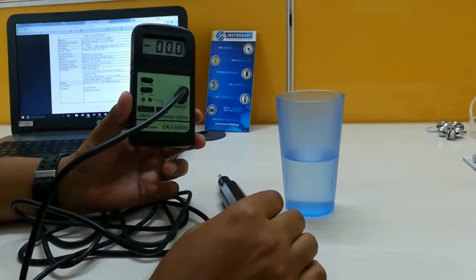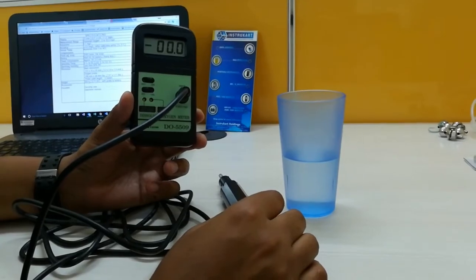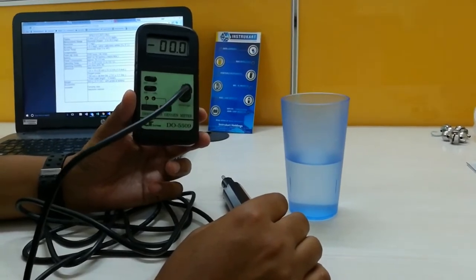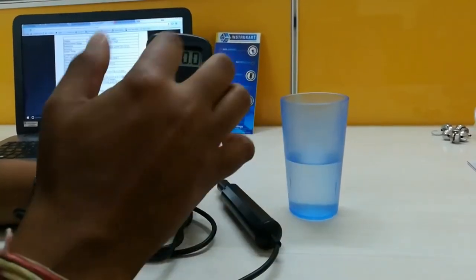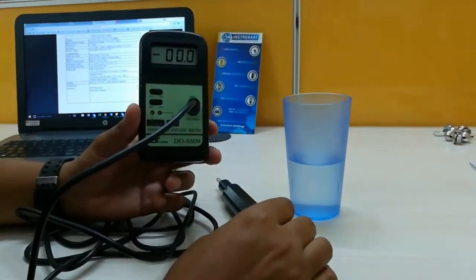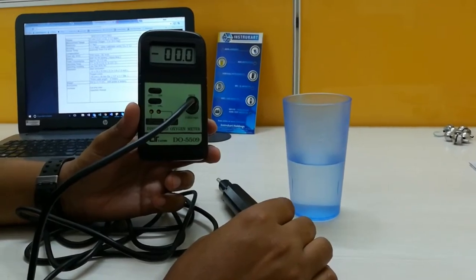The measurement range is 0 to 20 mg per liter. The resolution is 0.1 mg per liter and the accuracy is plus or minus 0.4 mg per liter.